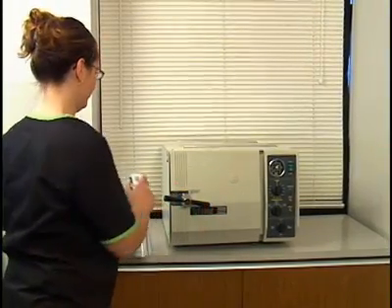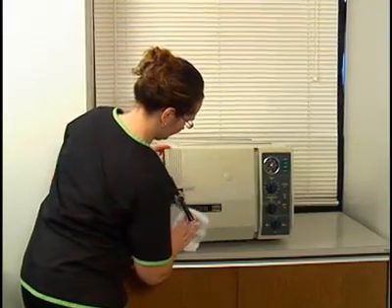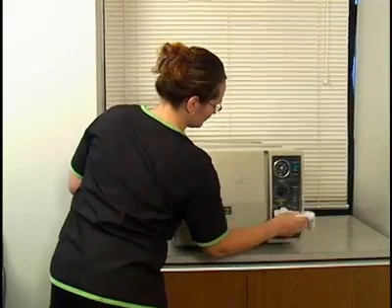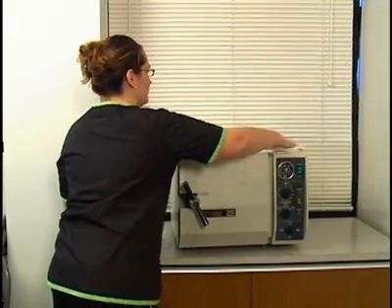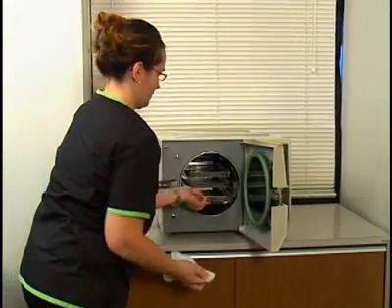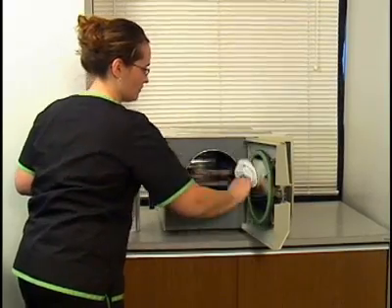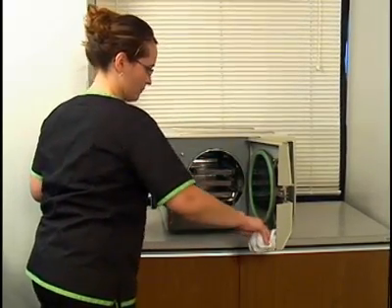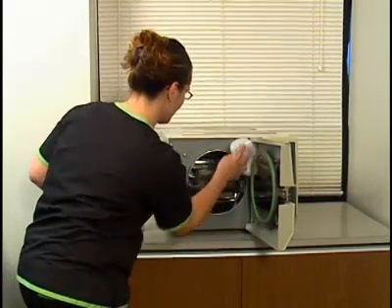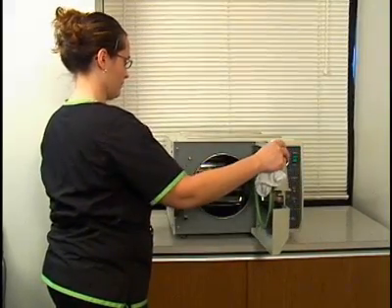Maintain appropriate daily care of the autoclave, following the manufacturer's recommendations. Daily care usually includes wiping the outside of the autoclave with a damp cloth and a mild detergent, wiping the interior of the autoclave and the trays with a damp cloth, cleaning the rubber gasket located on the door of the autoclave with a damp cloth, and inspecting the rubber door gasket for damage that could prevent a good seal. For the autoclave to work efficiently, it must be properly maintained.